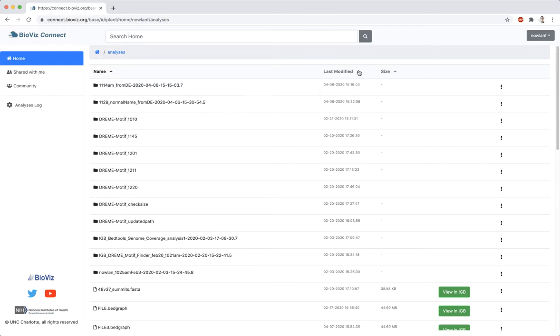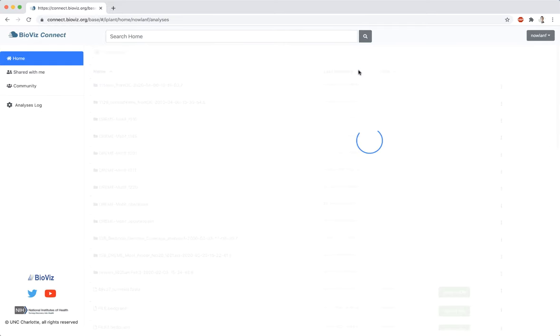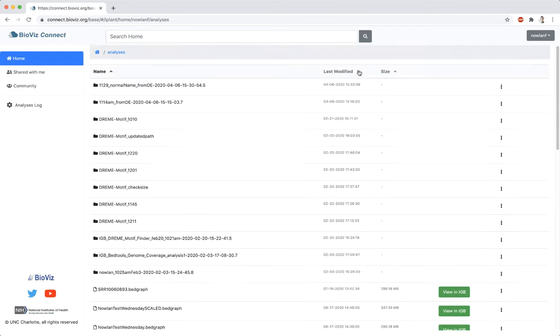If the file was located in the shared or community folders, then the output file will be located in the Analyses folder in your home folder.